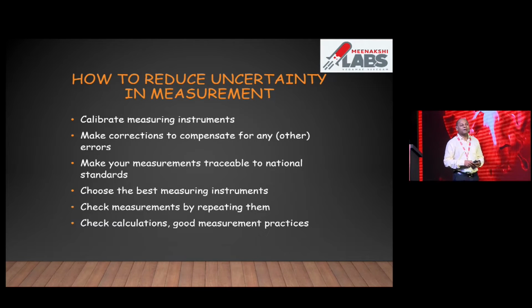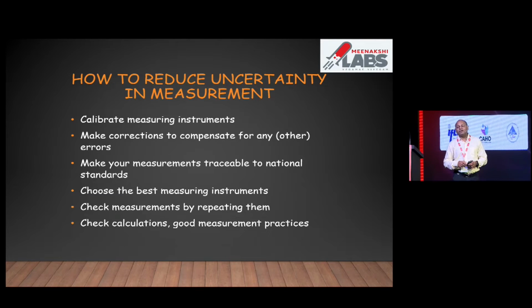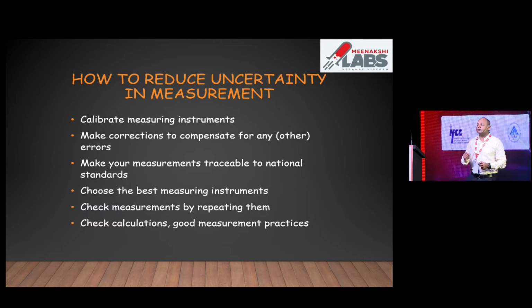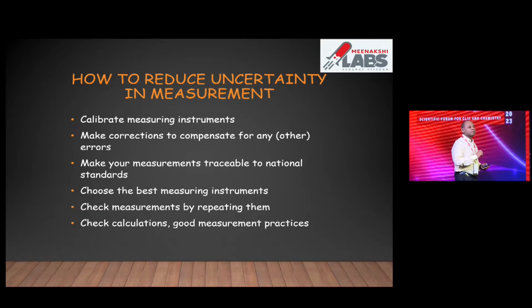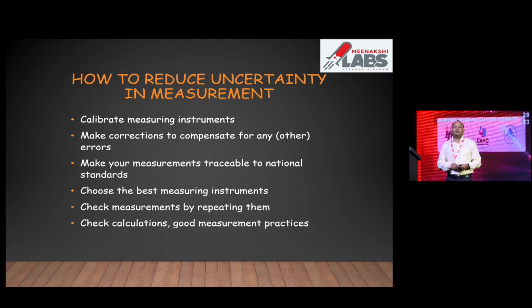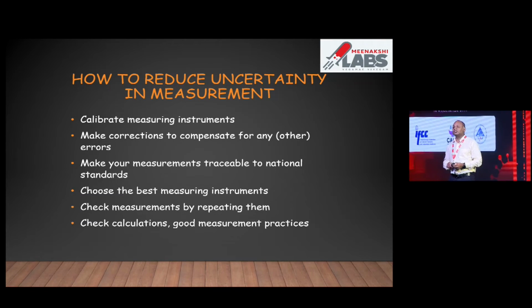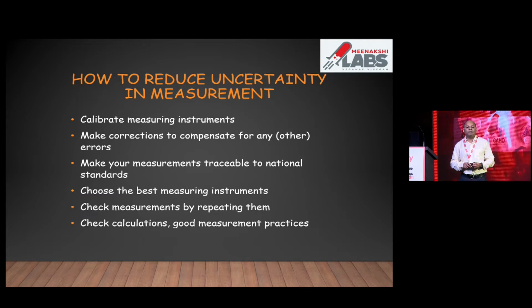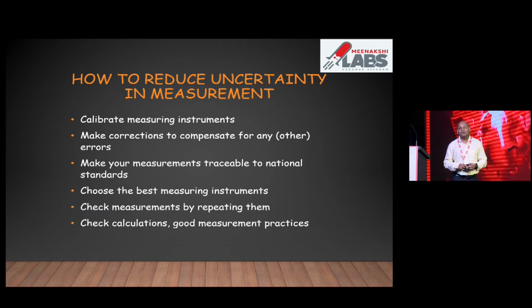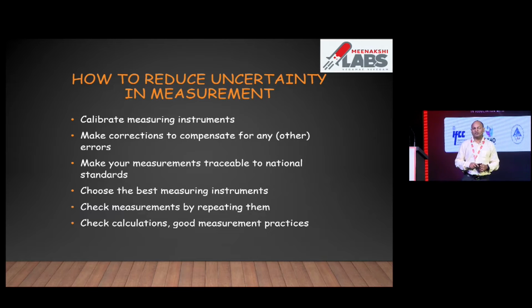Now, when I am talking about measurement uncertainty and its implication for clinical laboratory use, many times people ask whether it is important or necessary to mention this measurement uncertainty in your laboratory report. As far as medical laboratories are concerned, it is absolutely not necessary to include measurement uncertainty in your laboratory result. Whereas for other laboratories, which include food testing laboratories, plastic testing laboratories or some of the calibration laboratories, it is mandatory to include this measurement uncertainty in their report. But for medical laboratories it is not mandatory; rather, you should not include it because it will create more confusion for the clinicians.